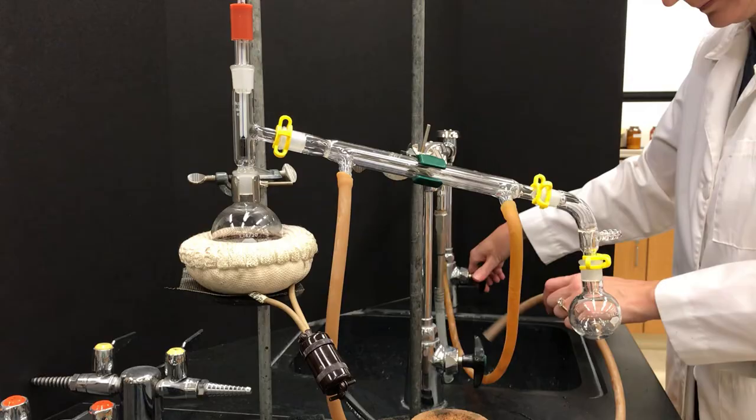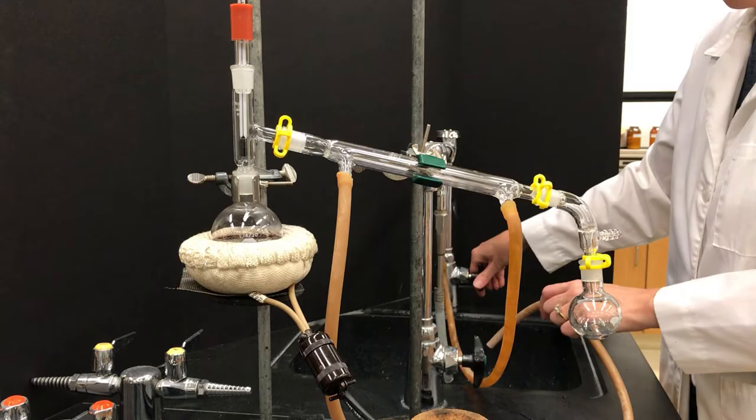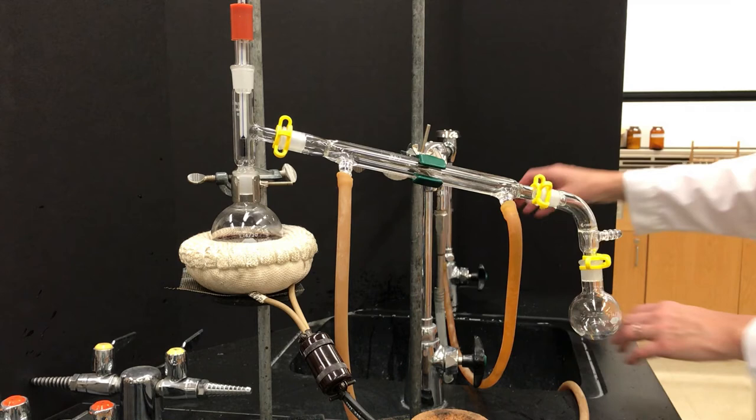Once we are heating it, it is important to start having water running through the condenser, so you're going to turn on the faucet. Turn it slowly at first—if you just crank it, then it's likely that those hoses are going to pop off—so start slowly and then make sure some water is going through the condenser. It goes in through the bottom, out through the top, and drains into the sink.